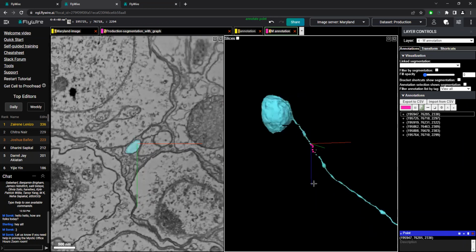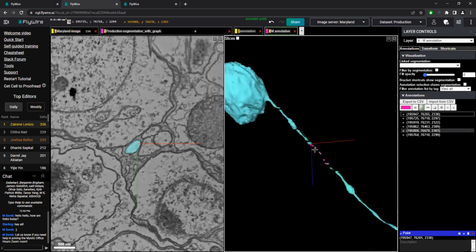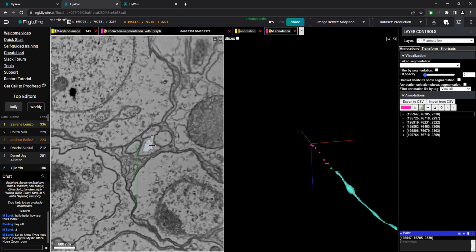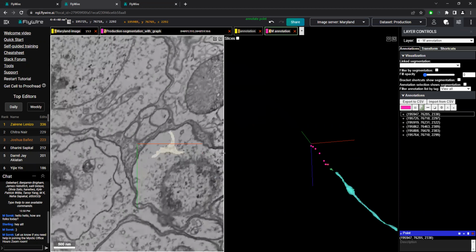And as you can see, Ankri's gone ahead and finished it because I'm using an out of date one. So yes, that's where annotations, use them to draw on your 2D. It's a huge help, especially when you get to these things like this. So the other thing we can do is, let's say we know, like this picture here, we know, oh, yep, these are the two in this, and we just didn't want to, we'll skip all the mess in between.